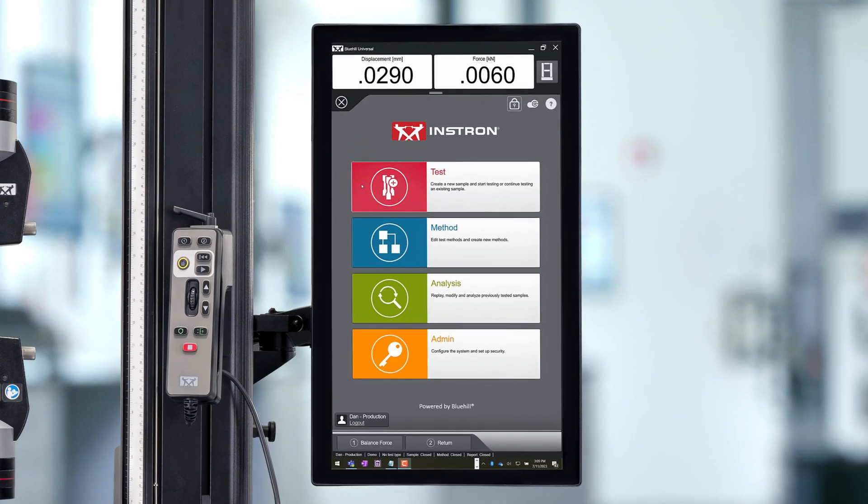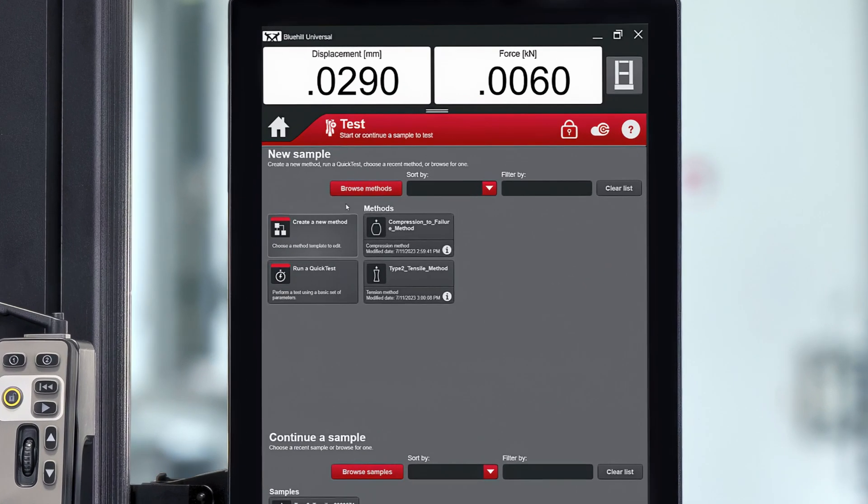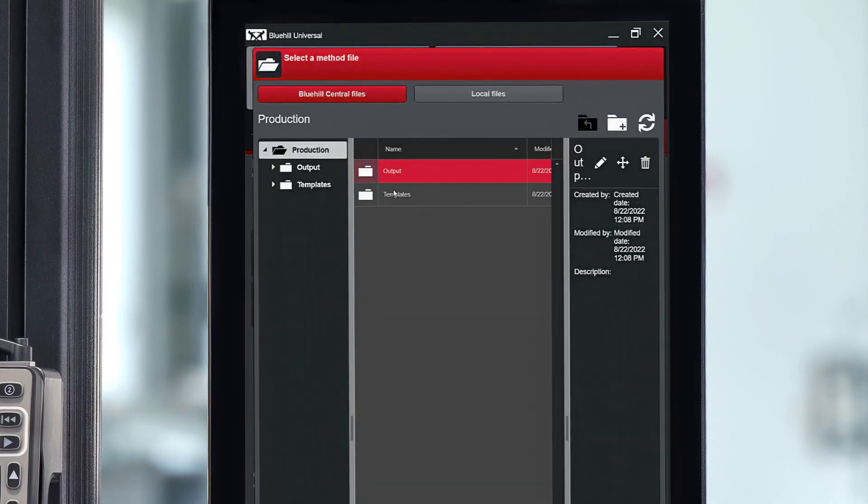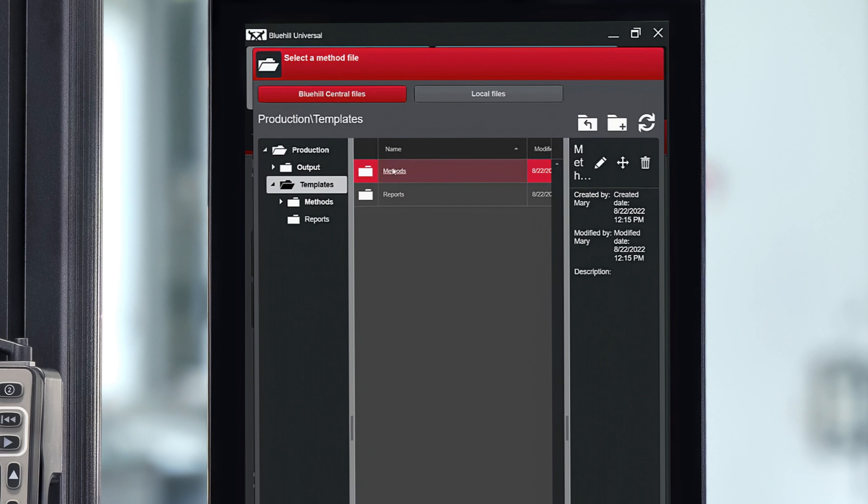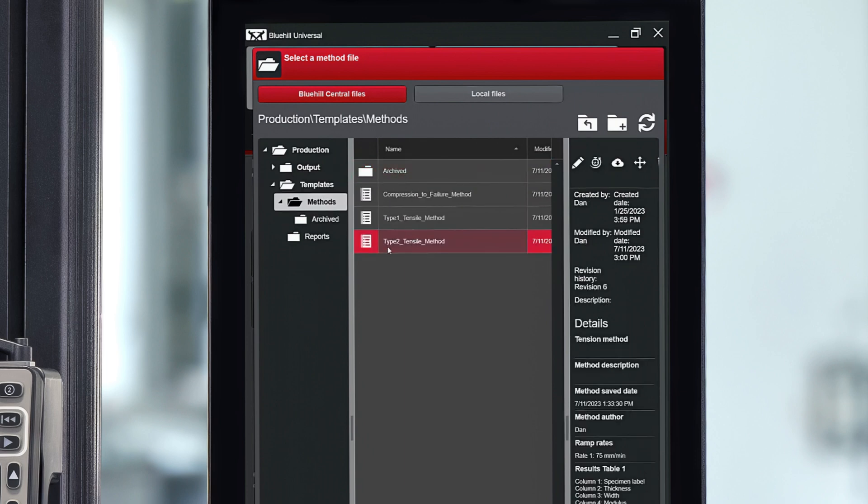When running a test in Bluehill Universal, you can navigate directly to the database to access the shared files, ensuring the correct test method is being used regardless of what system you are using.